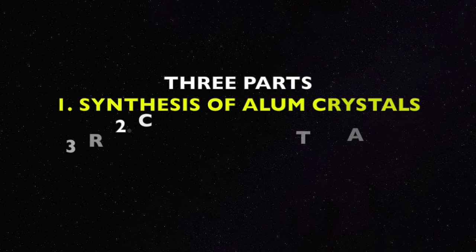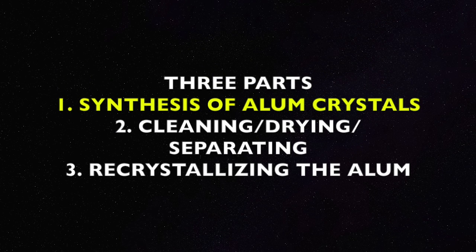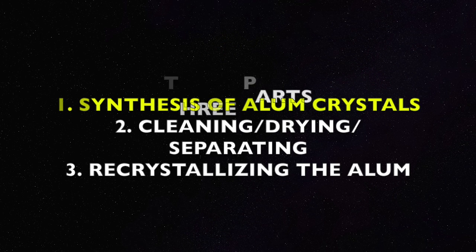This experiment was actually divided into three parts as seen below: the actual synthesis of the alum, rinsing the alum, and recrystallizing the alum. But we will be focusing on the actual synthesis of the alum.